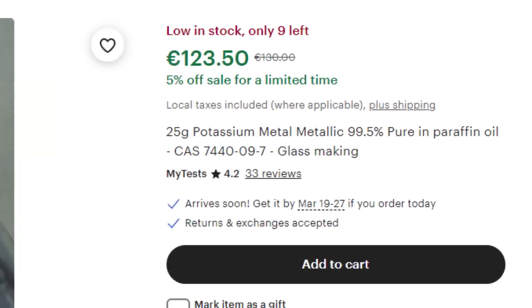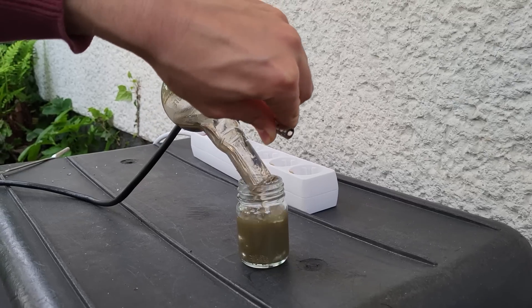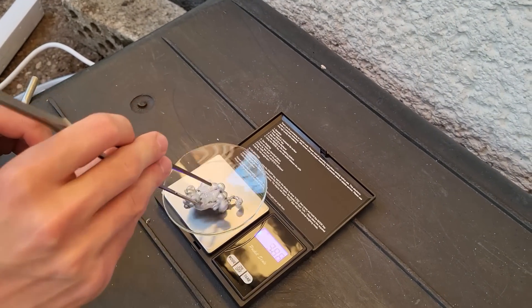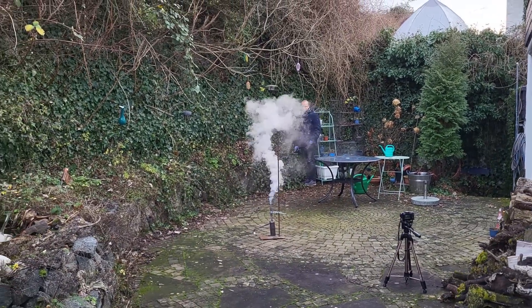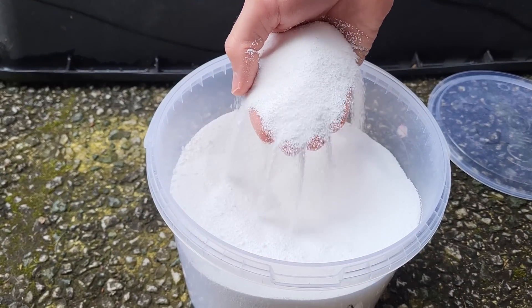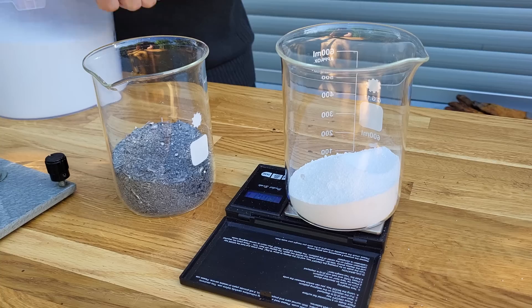But it is also quite expensive and difficult to get. I already demonstrated making potassium metal from its hydroxide in a previous video, but this process is not scalable at all, for a spectacular reason that I will reveal at the end of this video. That is why today I want to try and make a larger amount of it from potassium carbonate, also known as potash.